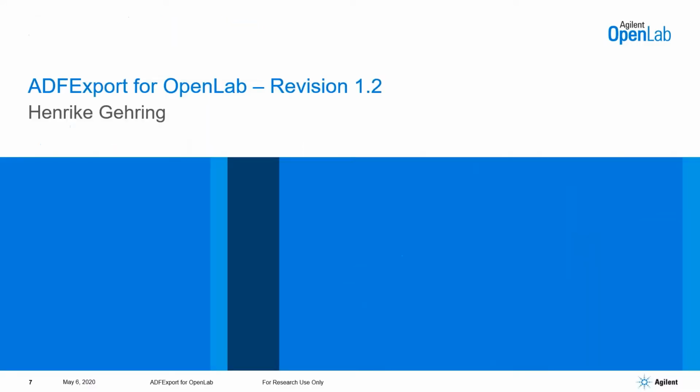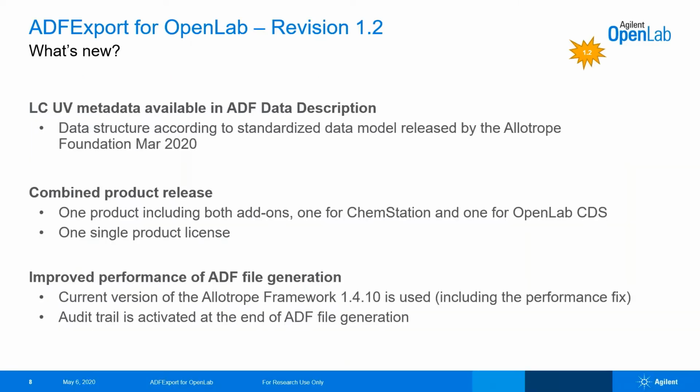She will give insight into the new release, ADFExport for OpenLab. Yeah, thank you, Ralf. So I would like now to present our upcoming ADFExport version and give you an overview about the functionality and the supported workflows within the Agilent data systems. So what's new in the version?